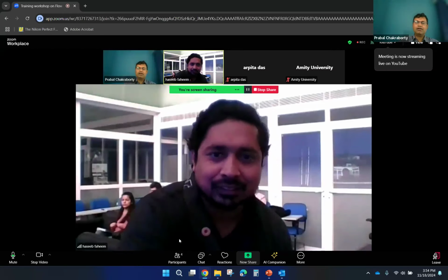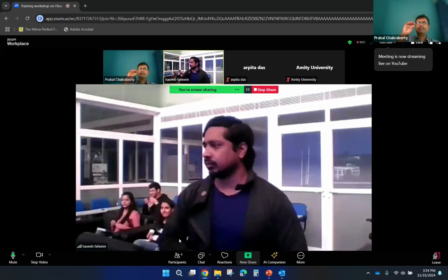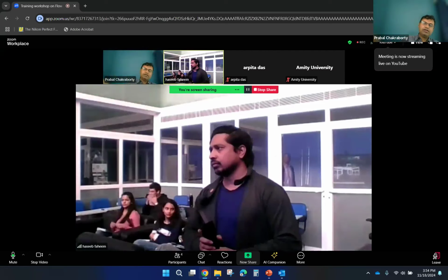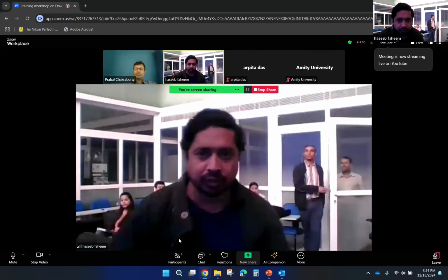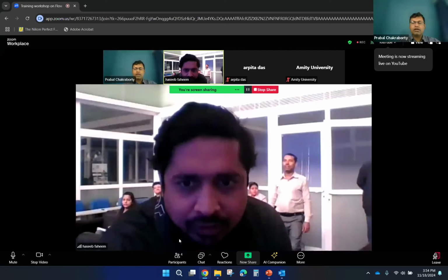But yes, probably if you keep in mind some information, there is a very good site, it's called Nikon Microscopy U. You can go there and search in Google and you can see the details there. So one question I want to ask you: what is the use of AI in confocal?